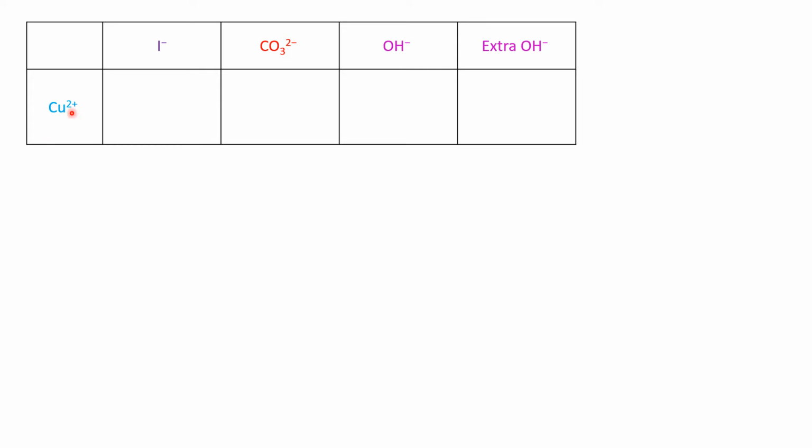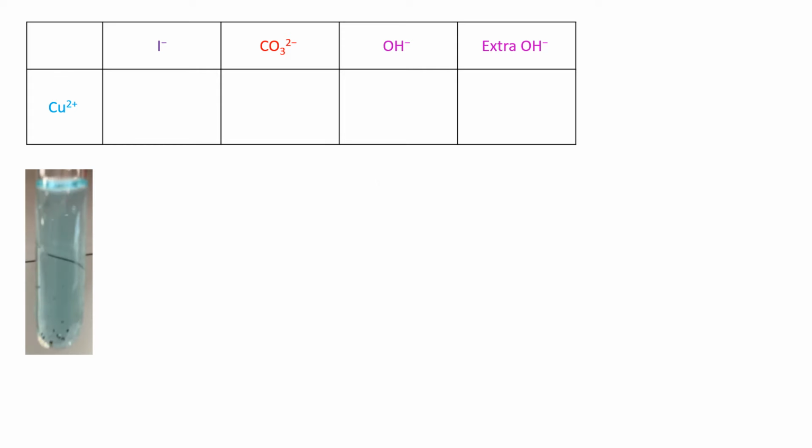Okay, so anyway, you take copper 2 ions. Now we took copper chloride for this. We could have taken copper sulfate, whichever way we do it. Copper 2+ in water, generally, unless there's something really weird which you're not going to encounter very often, is an octahedral copper if there's nothing else floating around in there. All 6 of the ligands are water ligands, and so copper 2+ is this lovely pale blue color.